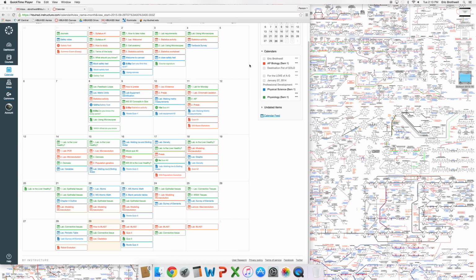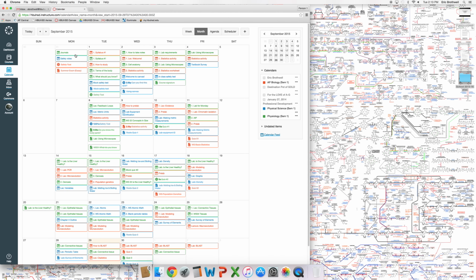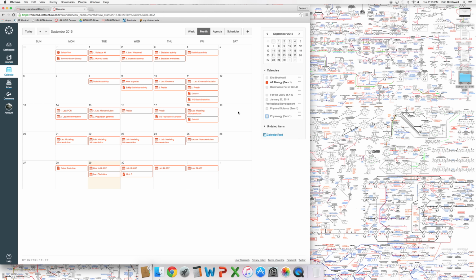So I want to walk you through how you actually would end up doing the BLAST search, simply because it's not too difficult if you follow the directions. So if you go to calendar, obviously I have a lot of junk up here and I need to update some more things. But how to BLAST, if you click on that, there's nothing there. I was supposed to show you in class, but clearly we didn't get there.